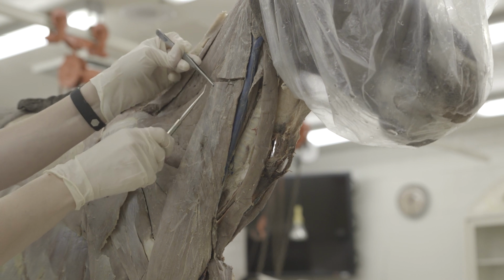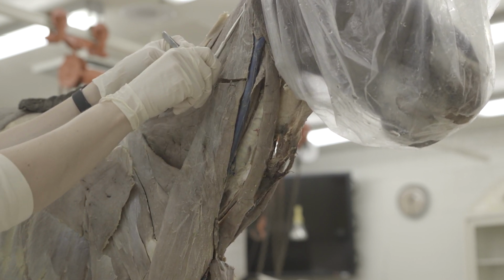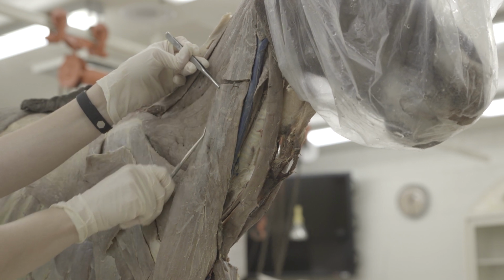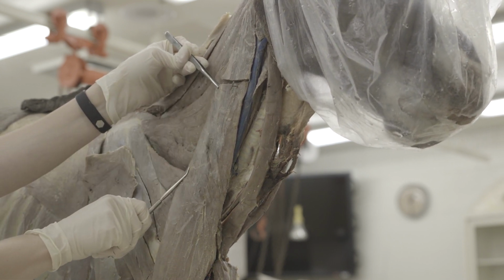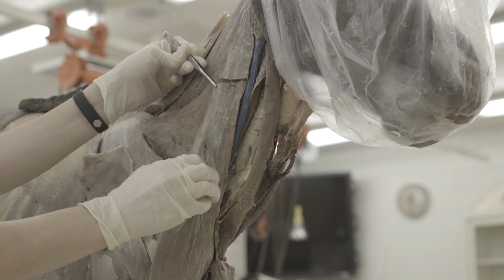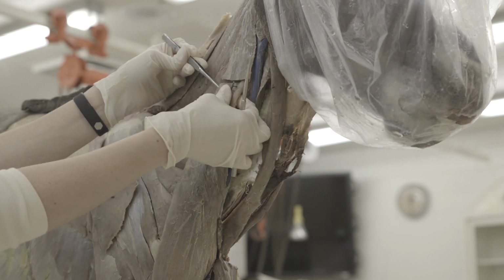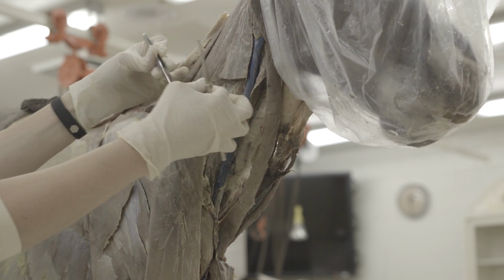And then your omotransversarius muscle, again, is fused to that brachiocephalicus. So it's this dorsal caudal border here would be omotransversarius, fused to your brachiocephalicus muscle. So like I said, you're going to transect that straight across and then reflect the distal portion of brachiocephalicus.